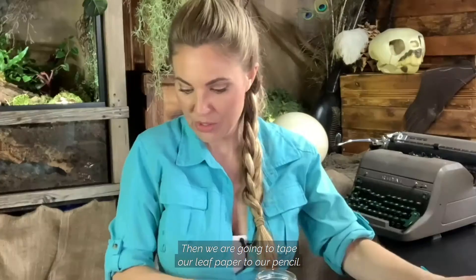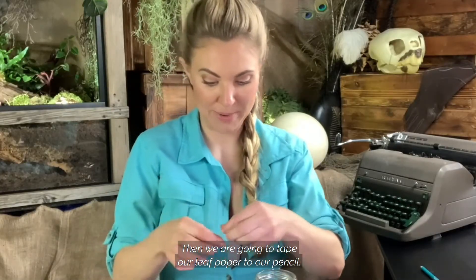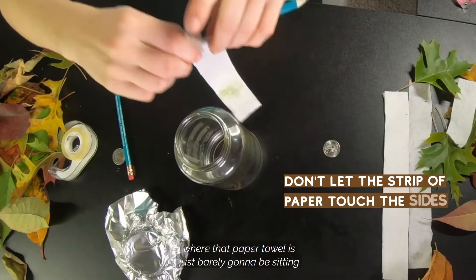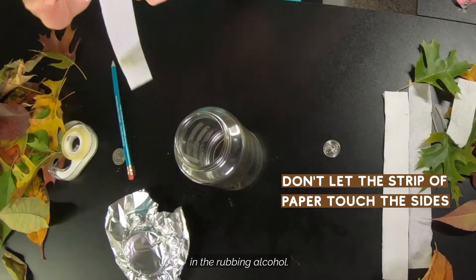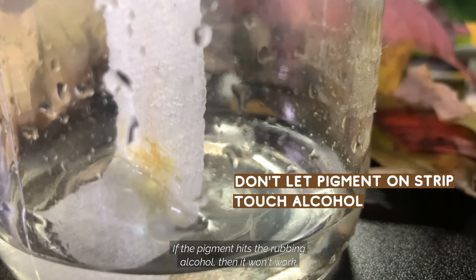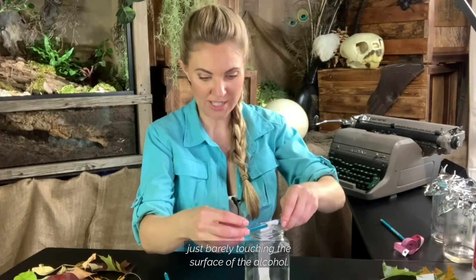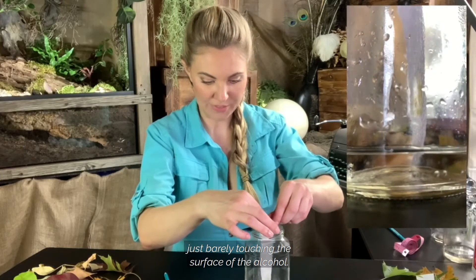Then we are going to tape our leaf paper to our pencil. We want to make it just long enough where that paper towel is just barely going to be sitting in the rubbing alcohol. We don't want it too far down. If the pigment hits the rubbing alcohol, then it won't work. We want to make it where it's just barely touching the surface of the alcohol.